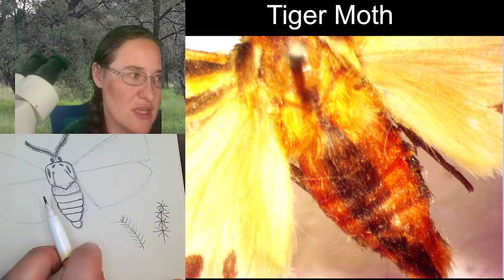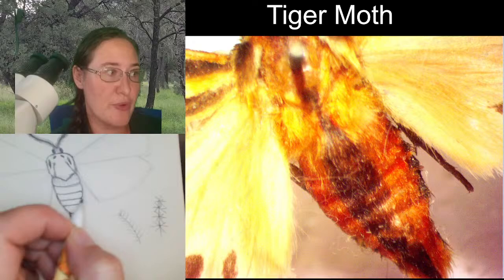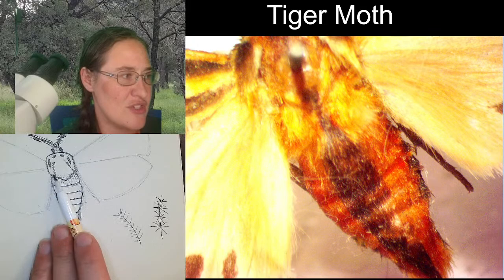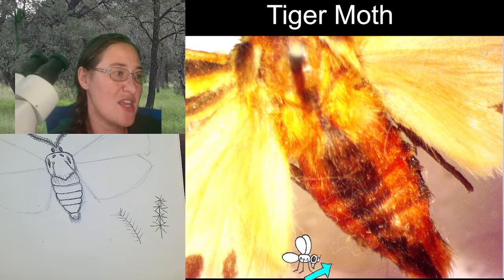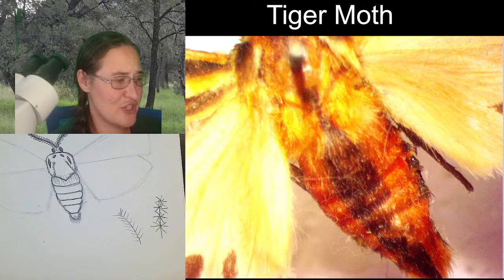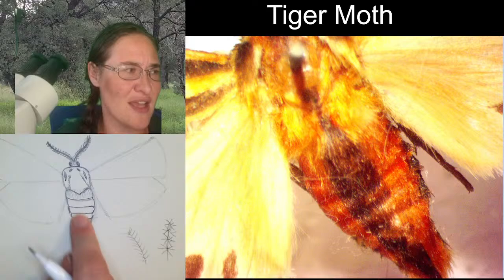Arctiids generally, you're going to laugh at me, but it's funny, they generally do have three spots along their body. They have lateral dots on either side, and then they have medial spotting in the center. If you look really closely, you'll see these darker spots along the edge. He has the same ones on the other edge. It doesn't matter if you're looking at this genus, a leopard moth, or an Isabella tiger moth, they all have these dark spots on the median and the lateral.